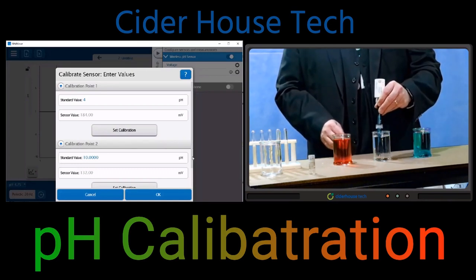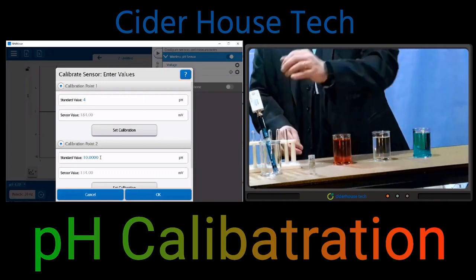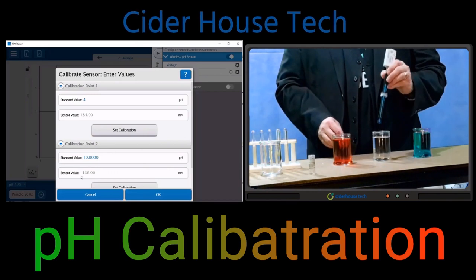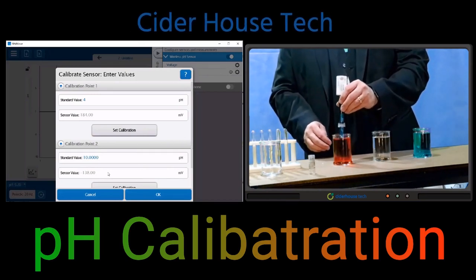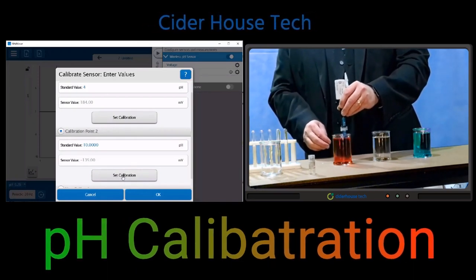Now I'm going to immerse my electrode into the second solution. In this case, it's a pH 10 solution. I'm going to dunk that in there and wait for a moment for it to stabilize. Again, this is the value in millivolts that's being read directly. We'll wait for it to stabilize, and once that's happened, we'll scroll on down and hit Set Calibration, and I'll click OK.